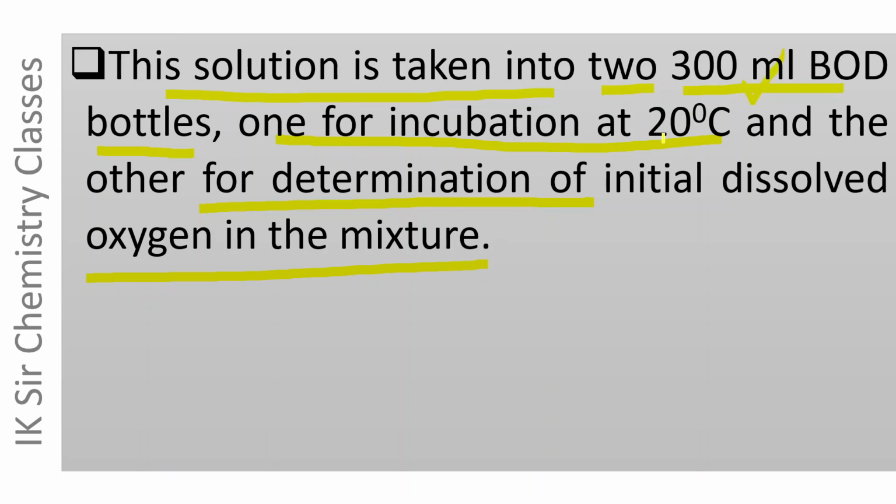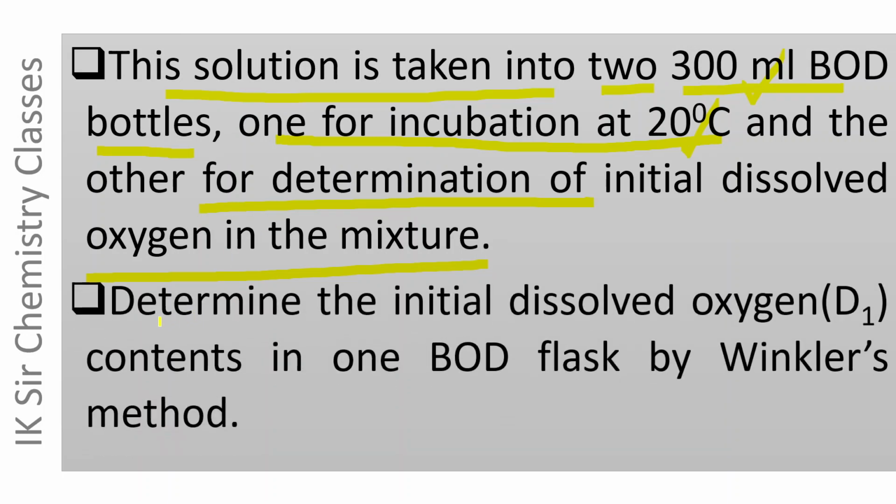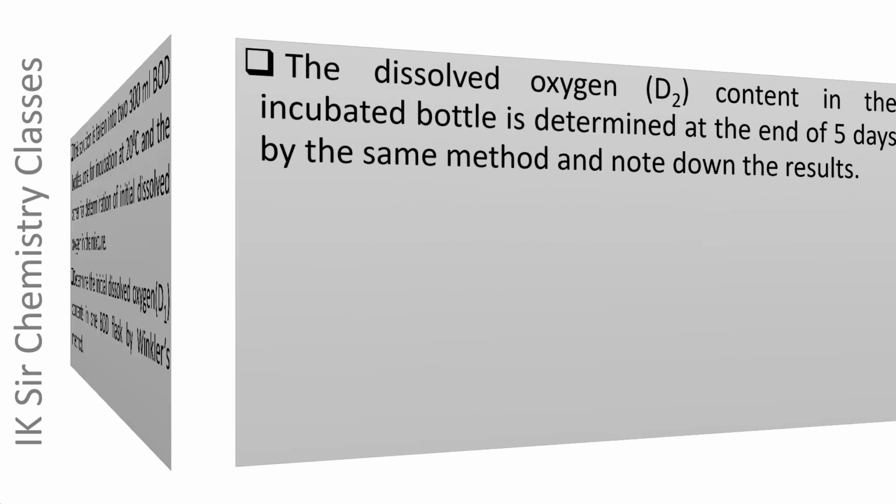One BOD bottle is incubated at 20 degrees centigrade for 5 days and in the other, the initial dissolved oxygen D1 content is determined by the Winkler method, as discussed in the previous video.